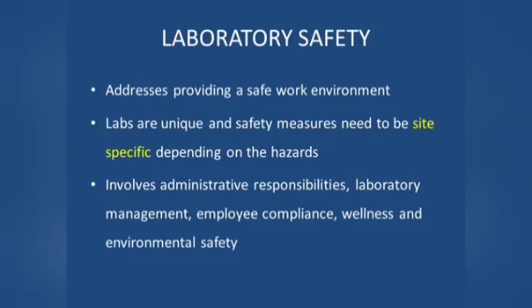For example, radioactive substances, biosafety issues in microbiology labs, and so on. Laboratory safety involves the administrative responsibilities, the laboratory management, employee compliance and wellness, and environmental safety.